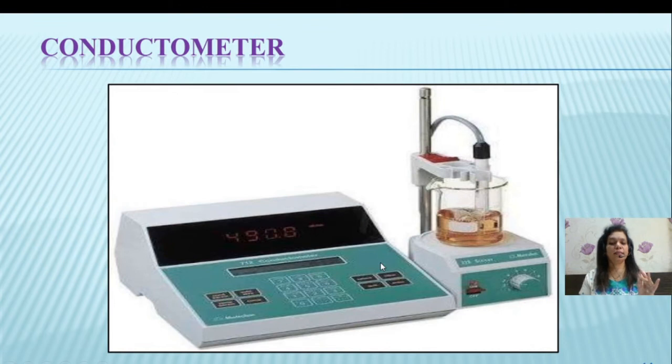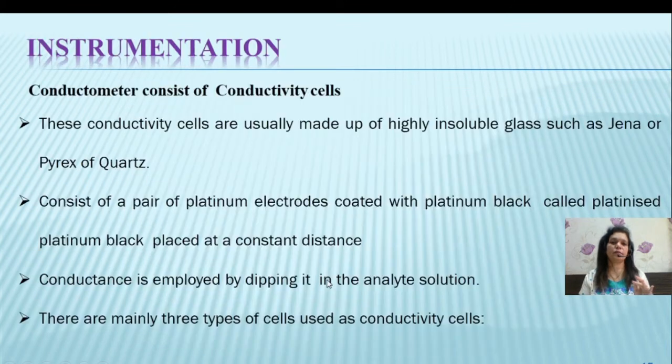This is the conductometer instrument we are using in a lab nowadays, where on this digital device we get the conductance directly by dipping this conductivity cell in a salt solution. We can maintain the temperature constant over here and find out the conductance of the given solution.